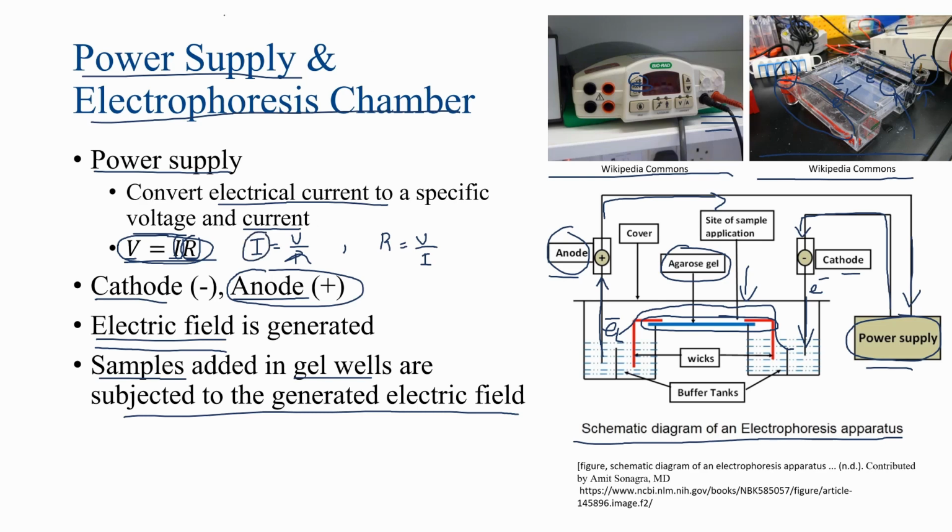Basically, if you have a wire, say this right here is a wire, and you have a charge somewhere, you will calculate the current by understanding the rate or the speed by which this charged ion will move across a region. Now, by convention in physics, the directionality of current flow is diagrammed as if you are assuming that it is positive charges that move from a higher potential to a lower potential.